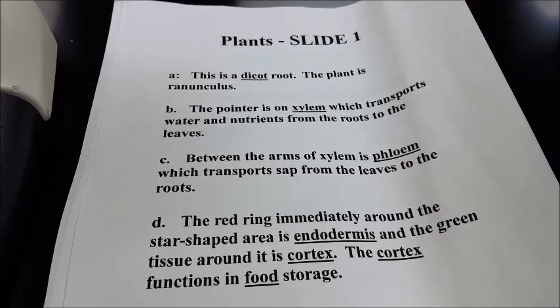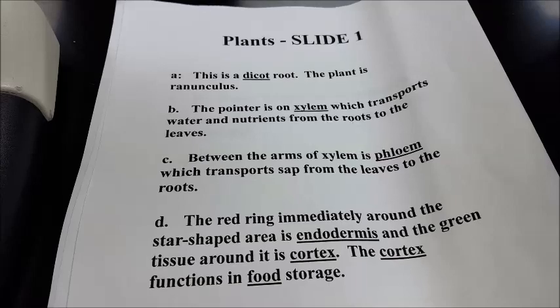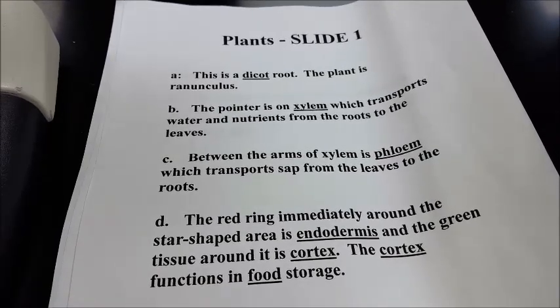Between the arms of the xylem is the phloem. This transports sap from the leaves to the roots and to other areas in the plant where sugar is needed.